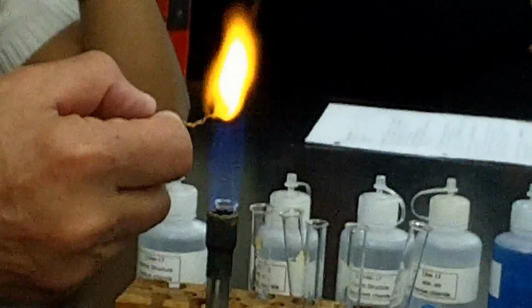So now we'll do sodium, see what sodium looks like. See the bright yellow flame from sodium? Sodium is present in most everything we touch. If you were to touch this with your fingers, you'd actually transfer sodium from your sweat glands onto that and you'd see the bright yellow color. So the bright yellow color is going to stay for a long time. Sodium is very persistent, see? It even hides the green color that we saw before. You can't get rid of the sodium, that's why I did it last. So when you're doing your tests, you'll be doing sodium at the end, all right?